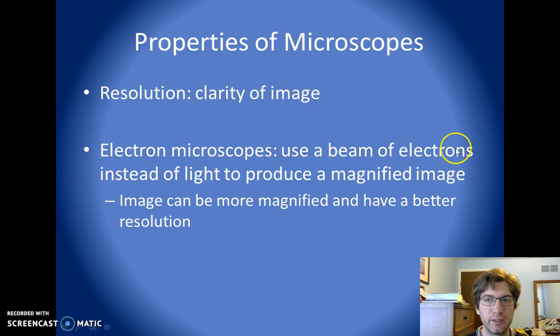Our next property is resolution. Resolution is clarity of image. This is pretty much the same kind of resolution as on your computer.